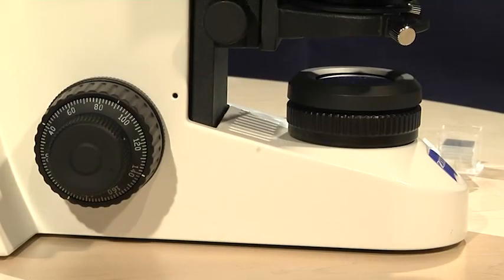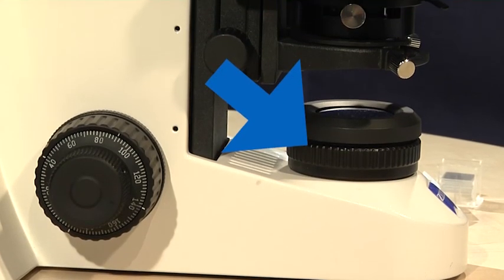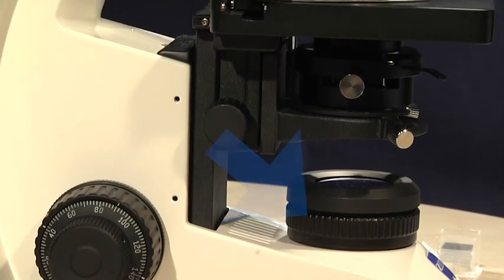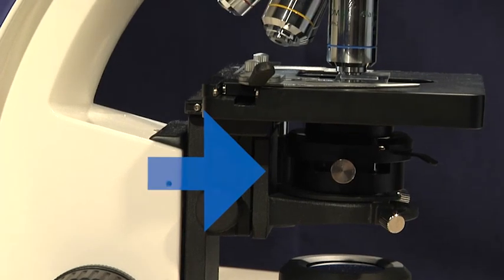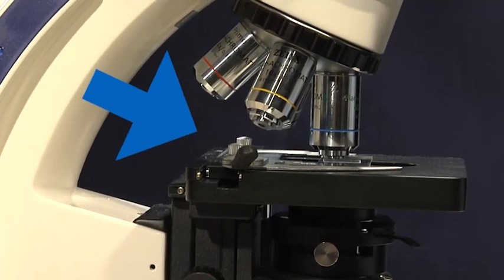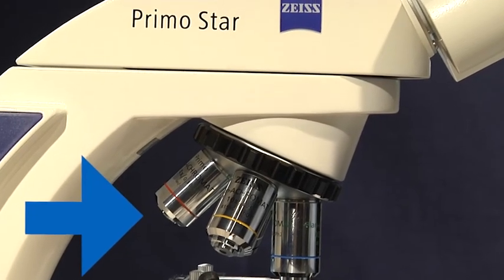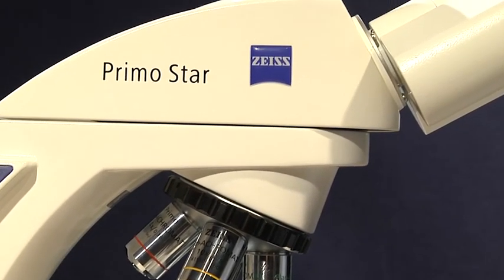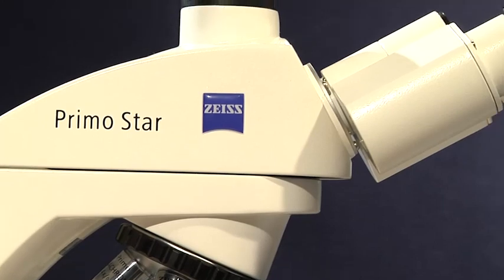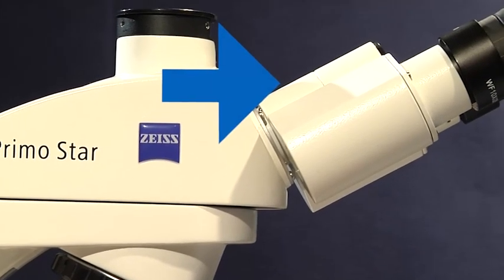Following the light path, the compound microscope is composed of the light source, the condenser, the specimen stage, the objective revolver with various objectives, and the eyepieces or oculars.